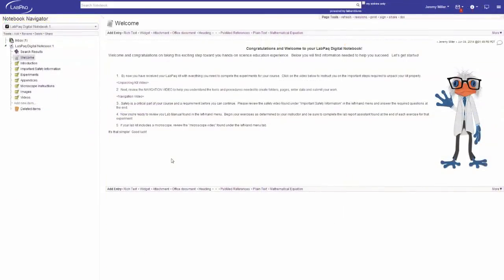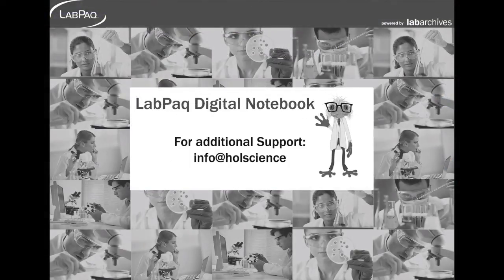Of course, there are many other things that you can do with your LabPack Digital Notebook, and we've prepared a series of short tutorials available from the support menu. Simply click on the tutorials and select the ones you'd like to see. If you have any questions, please feel free to email us for support. Thank you.